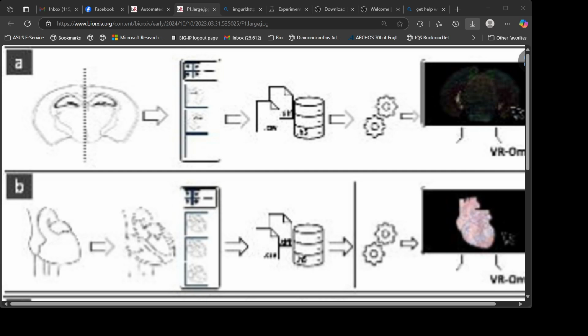C. Heat map comparison of analytical features supported by VR-Omics and other available software for ST analysis. Software is outlined on the y-axis, while analytical features are listed on the x-axis and colored according to their applicability to multi-slice coplanar or 3D stacked datasets. Features supported by the software are displayed in teal, while unsupported features are displayed in dark blue.